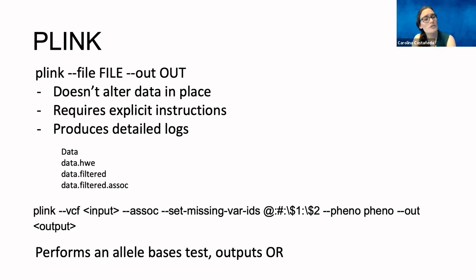It also produces detailed logs. Every time you run an analysis, PLINK will produce an output, and it will also produce a log of what was performed on the input. This log file has what the input was, on what date it was performed, what was performed on it, and how many samples were analyzed. It's very helpful because when you go back in time and want to see what you did to obtain your results, you can rely on the logs from PLINK and look at what your input was, what your output was, and what was performed to get to your conclusion. So that's also very useful.